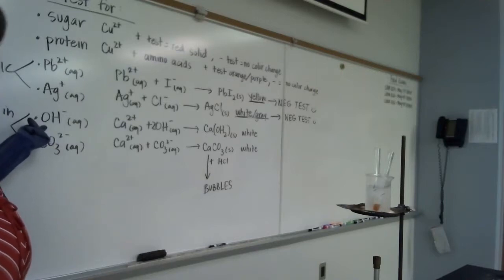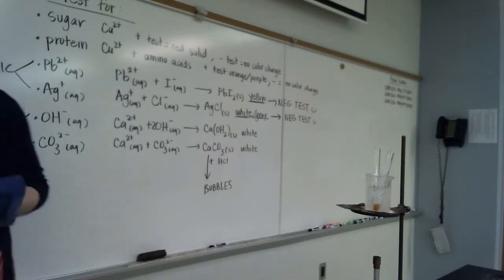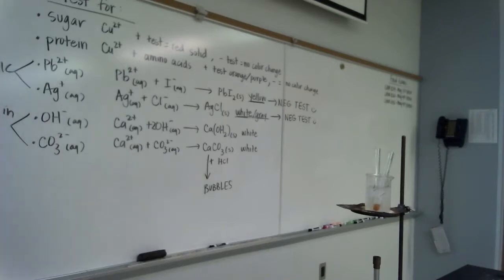And if the pH of this water is less than 7 or close to 7, I can conclude that there's not a whole lot of hydroxide ion in here. So take a second, decide, is there hydroxide or is there not hydroxide in decent concentration? I'm going to go grab some pH paper and then we'll decide.